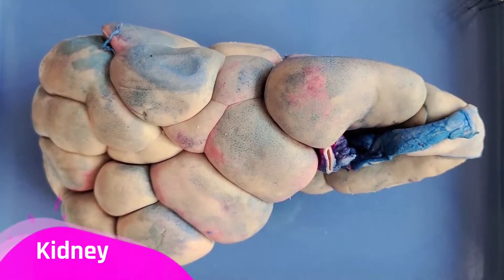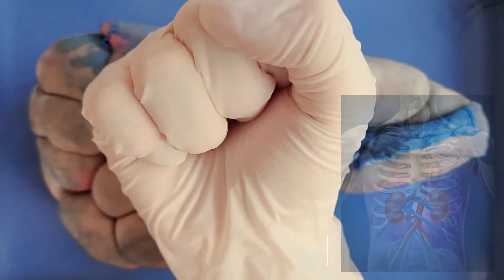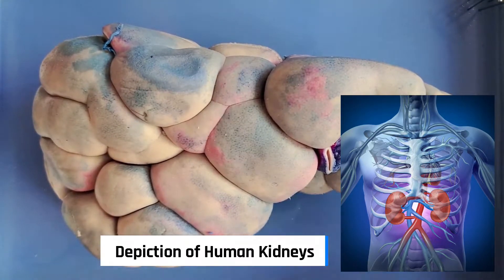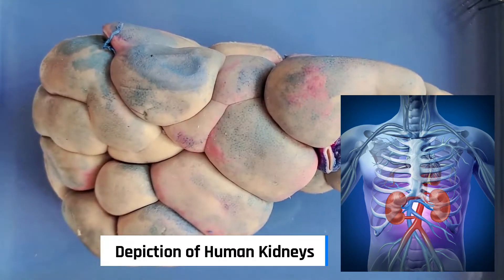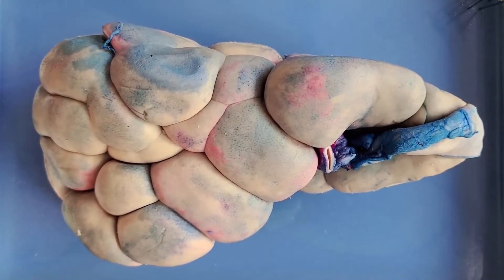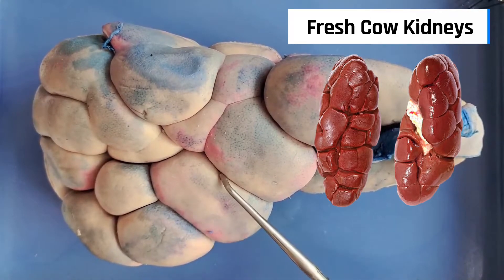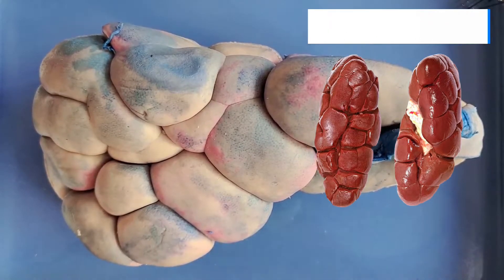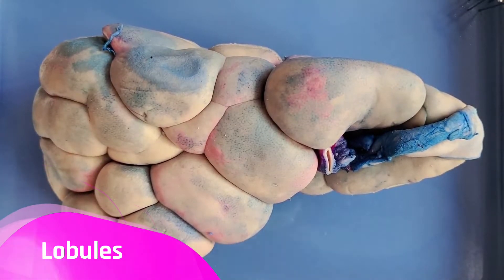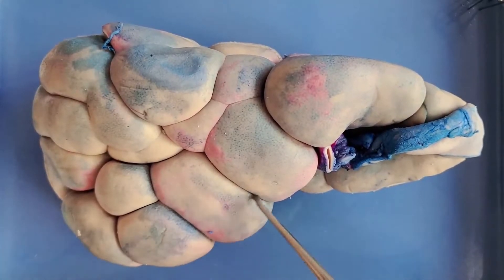Your kidney is roughly the size of your fist and is shaped like a bean — like a kidney bean — but this one is a lot larger because it's from a cow. It's also not quite bean-shaped; you can see it's very bumpy. This is because the cow's kidney is divided into about 12 sections called lobules. Here is an example of a lobule, and here's another one.